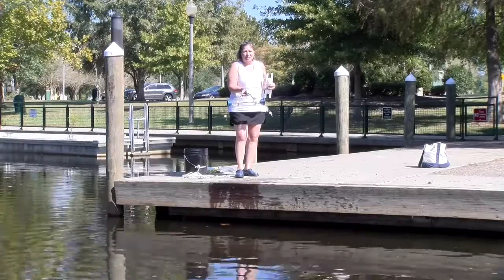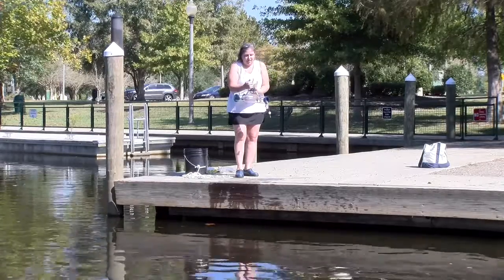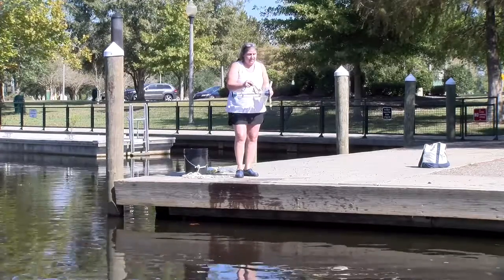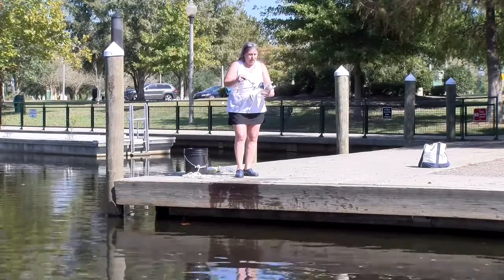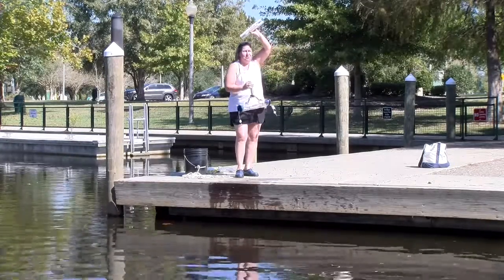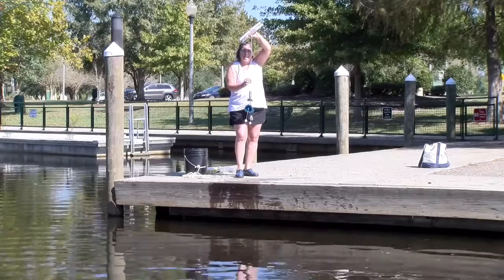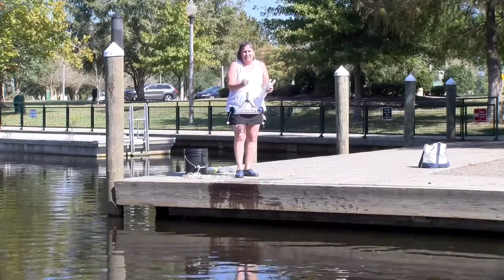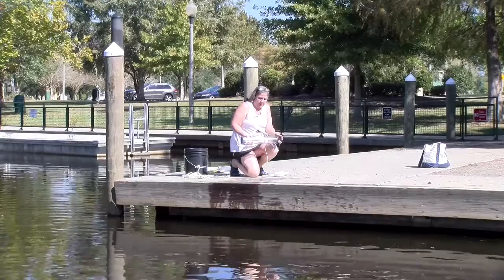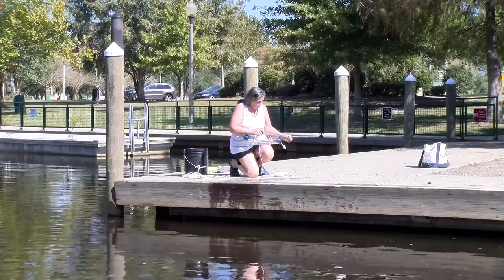So another way to take a water sample at depth, not surface water, is to use a Van Dorn water sampler. This water sampler has a messenger that goes down and releases the sides, which allow you to capture the water at depth. Also, the line that we use has measurements, increments of 1 foot, so that you can tell at what depth you're taking that measurement. So the way that you set the Van Dorn up is that you pull the sides and clamp them onto the bushing.